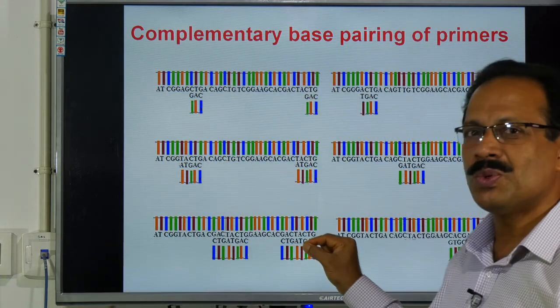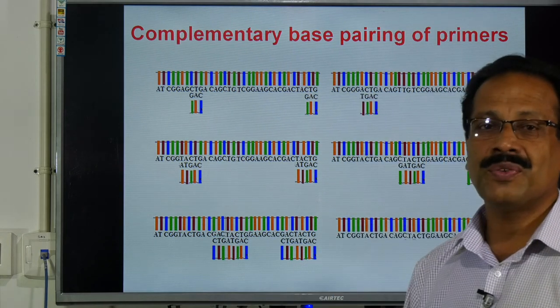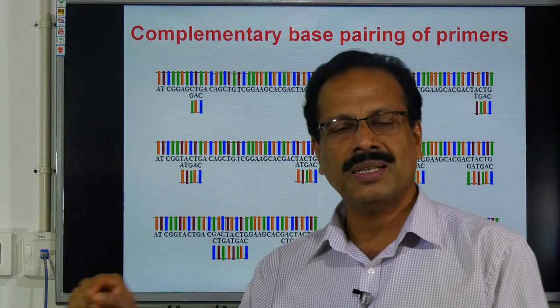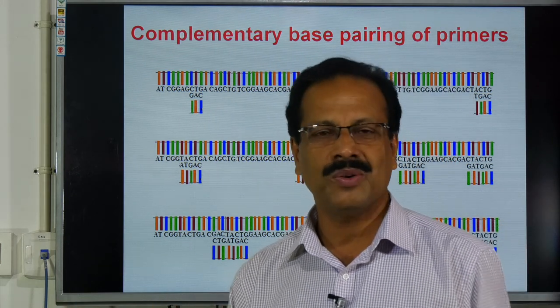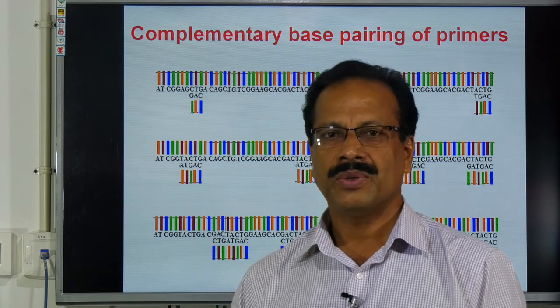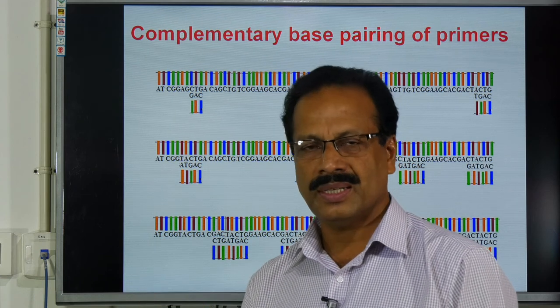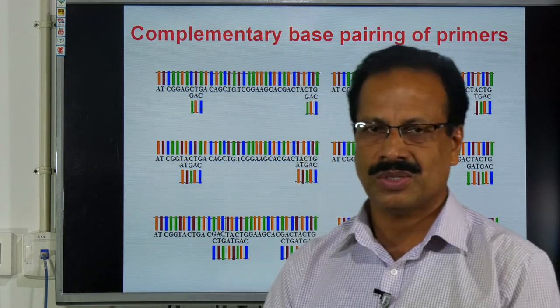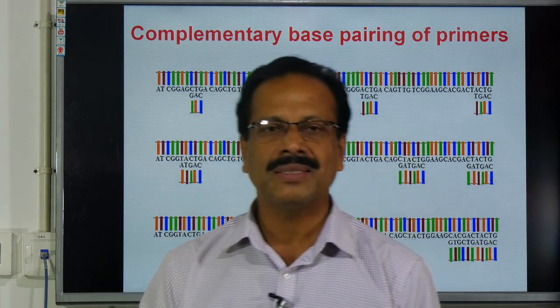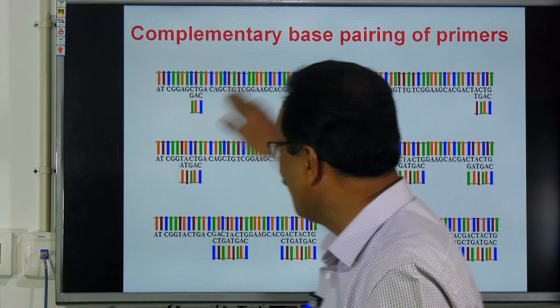All these jobs will be done by the software. In the past, it was very difficult. You had to look at each and every sequence and design a primer. Now it is simple. You select your sequence and supply it to the software, and you provide the conditions, like what percentage of GC concentration you want, and what is the desired length of your product, and the primer software will pick that. All these will be satisfied.